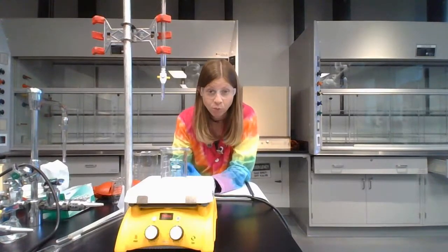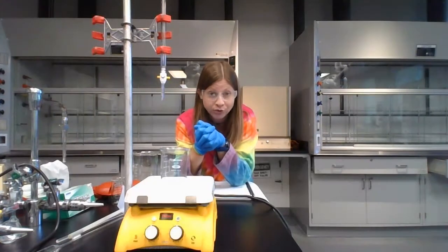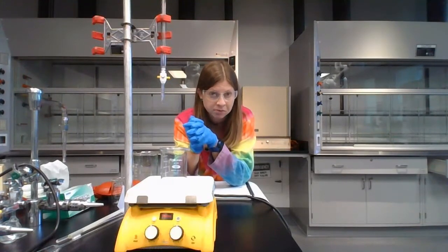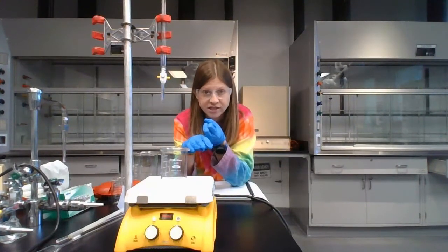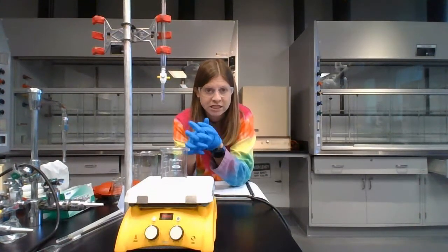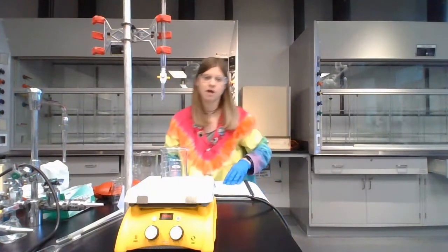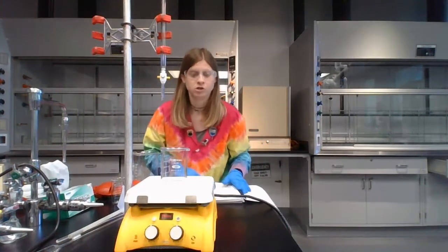So for this lab, we will be using nitrile gloves like normal. And if during the course of the lab you get lots of chemicals on them, more than just a drop or so, where they become discolored, those need to get taken off and replaced. All paper towels and gloves that get excessive amounts of chemicals on them need to be placed in a separate container other than the trash can. If there's just a small amount of chemical on them, they can go in the trash can. But if gloves or paper towels have lots of chemicals on them, there'll be a special place, and you will be shown that when you're in the lab.